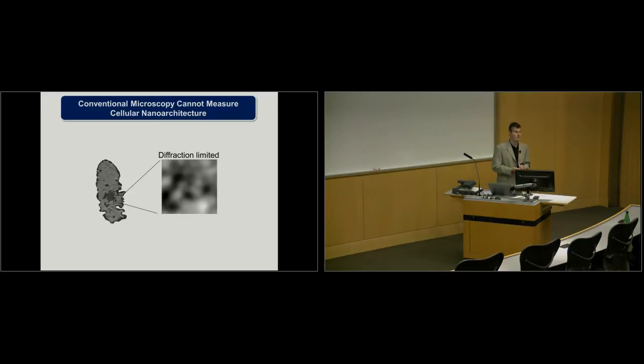In exceptional circumstances, it can go down to 10 nanometers, but conventionally, the commercially available instruments go down to about 40 nanometers. More advanced instrumentation, some of it developed here, can go down to 20 nanometers. Essentially, you beat the diffraction limit by an order of magnitude or more.